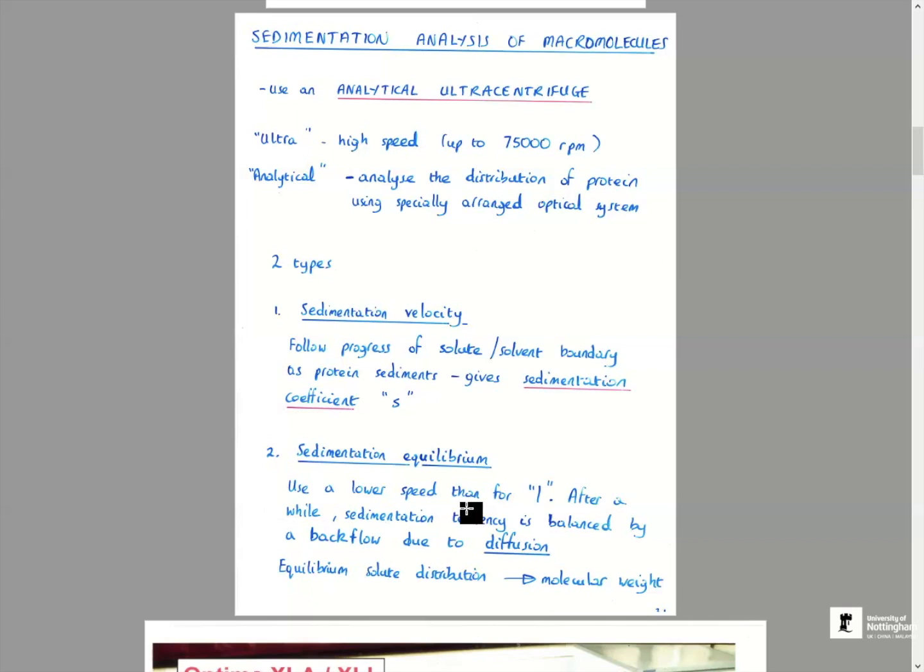If ovalbumin solution was being run, say, at 20,000 RPM, then what happens is, as we sediment macromolecules in a container, the force is spin like that, and there's a force outwards. So the macromolecules will tend to pile down to one end of the container, leaving clear liquid behind.